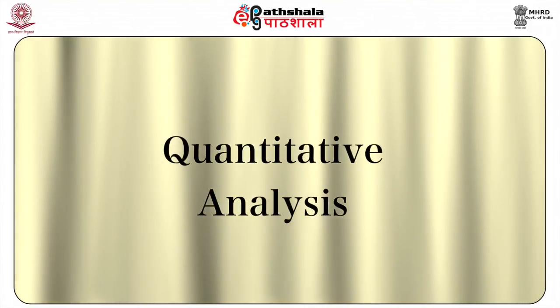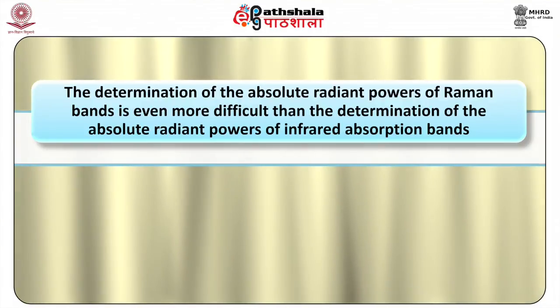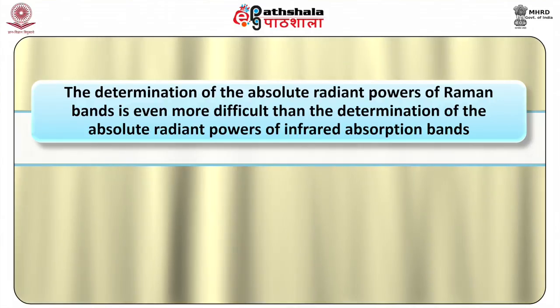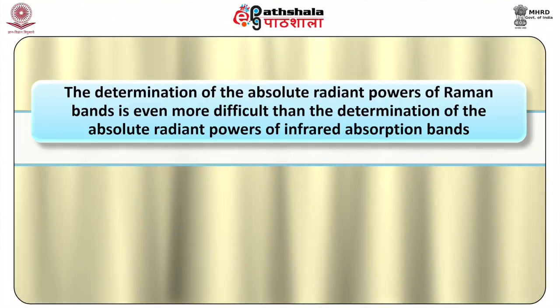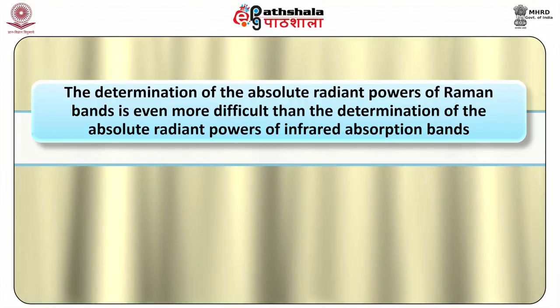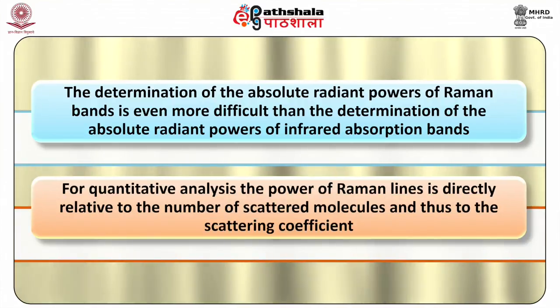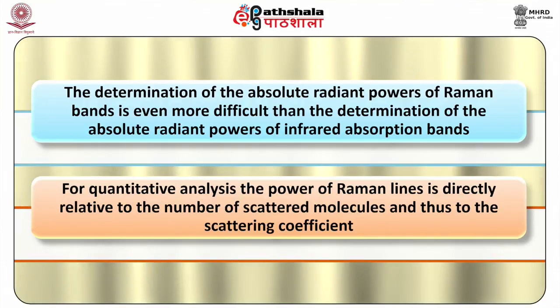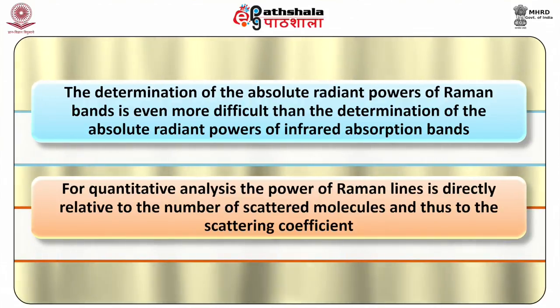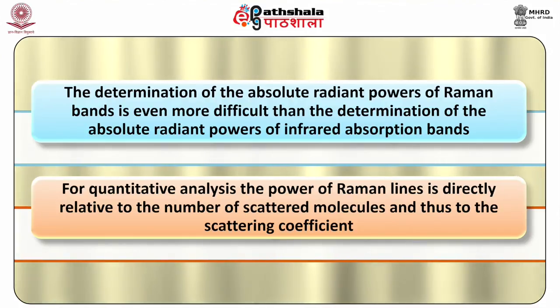Quantitative analysis. The determination of the absolute radiant powers of Raman bands is even more difficult than the determination of the absolute radiant powers of infrared absorption bands. For quantitative analysis, the power of Raman lines is directly related to the number of scattered molecules and thus to the scattering coefficient.